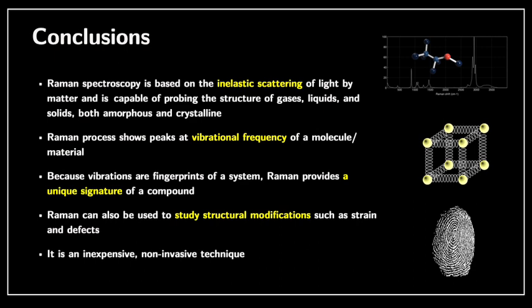What's nice about Raman spectroscopy is that it's inexpensive and a non-invasive technique, so it does not modify your material. Once you characterize your material with Raman, it is not going to be destroyed, and you can use this with a tabletop kind of experiment.